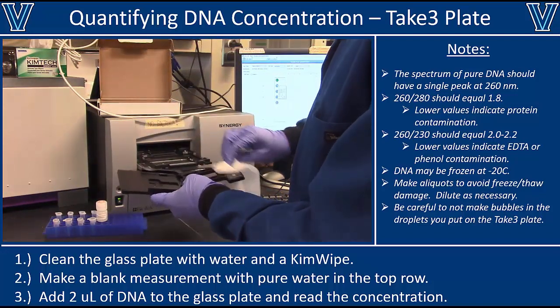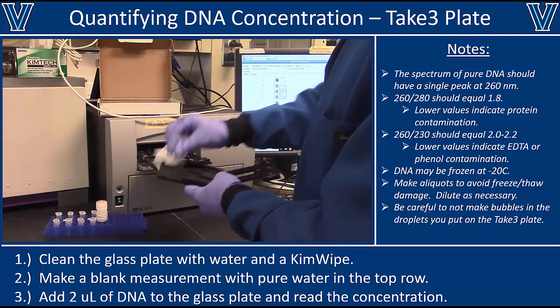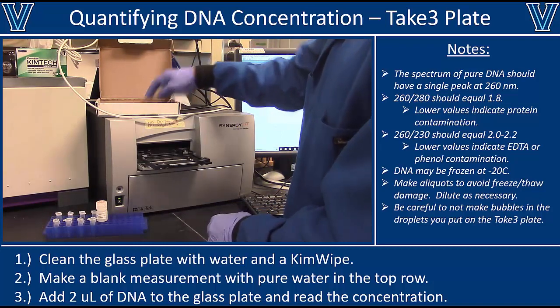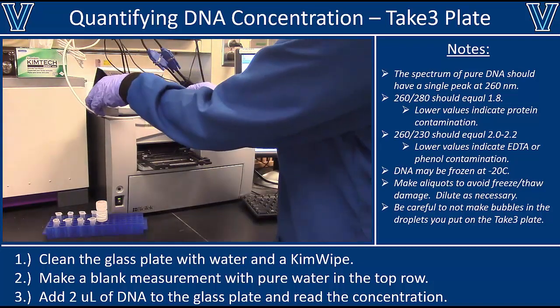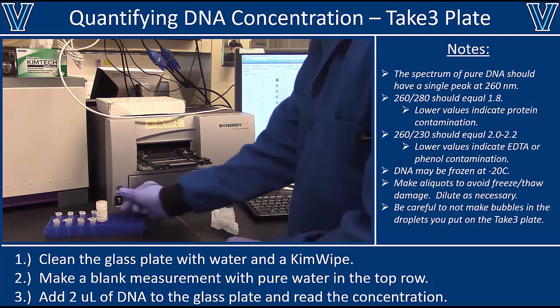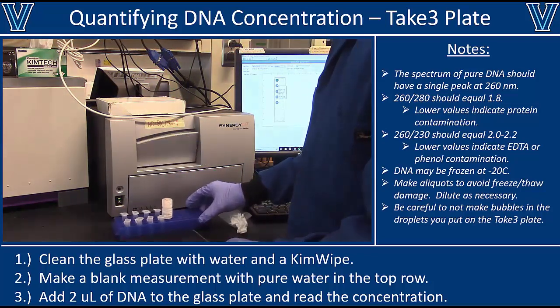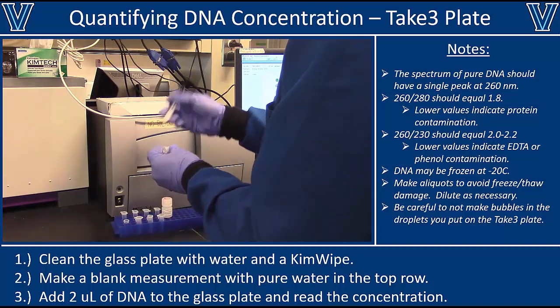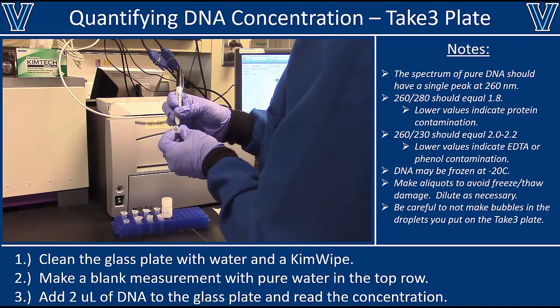Now, once you're done with the Take3 plate, wipe it off with a Chemwipe, make sure you get all the sample off of there, and then put it back in its storage container. You also want to take the concentration measurements that you just recorded and put those directly onto the sample tubes. And if this is the last time you will be using the plate reader today, please turn that off as well.